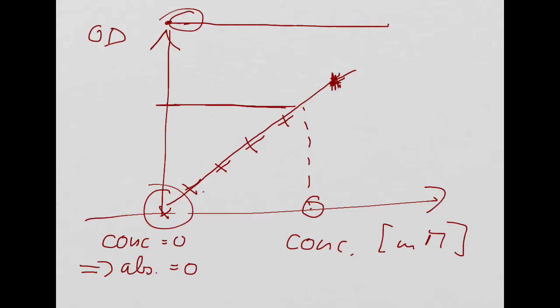Because what you can do is, your line would still be a straight line, wouldn't it? Even if you forget to zero, it just doesn't start at the bottom. It might start somewhere here. But it's still a straight line. So how do we get from the blue line to the red line?